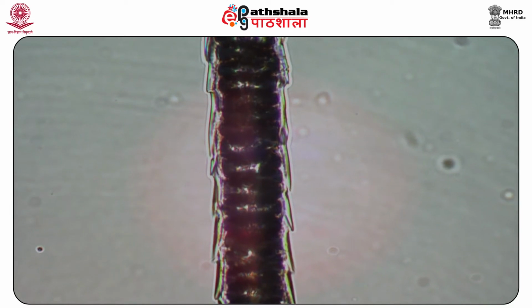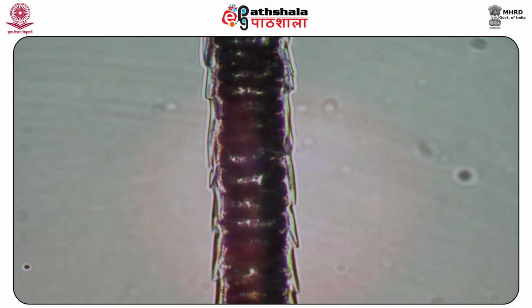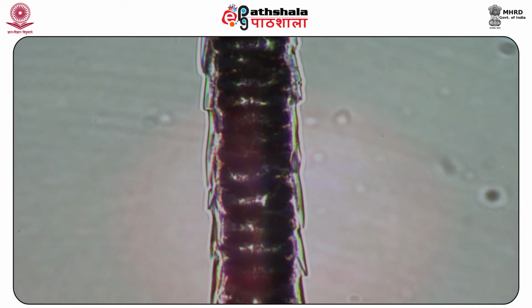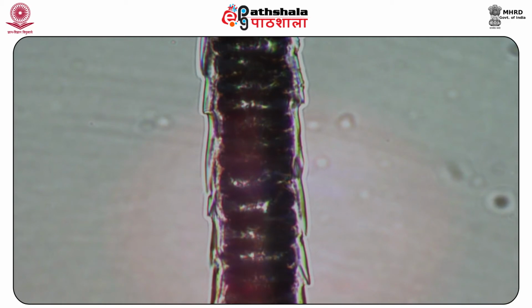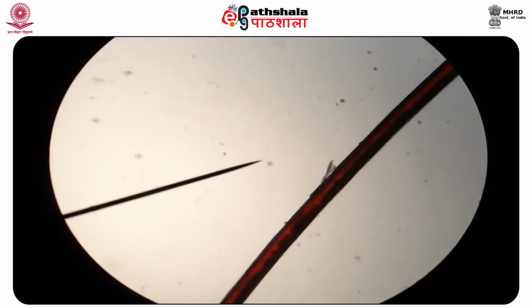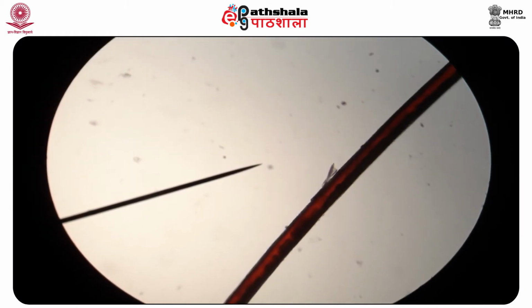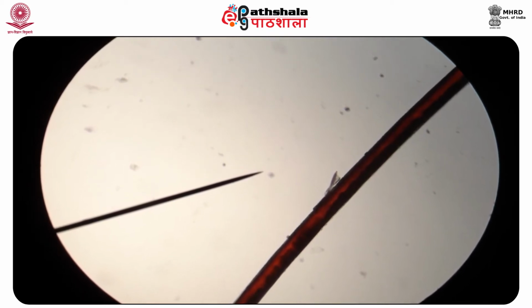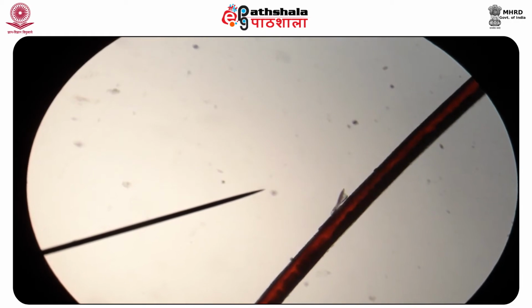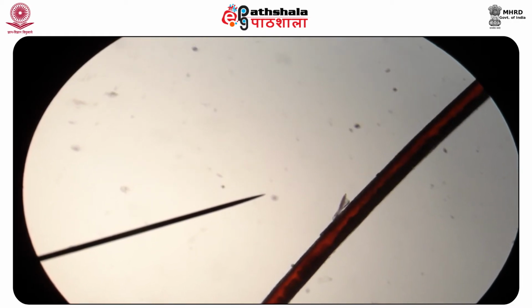Cleaned and washed hair should be dried before mounting it. Those hair samples which show thermal or mechanical damage may be more brittle and should be handled carefully. The various types of microscopes used for the examination of hair are as follows. First is the stereoscopic microscope. For initial examination of mounted or unmounted hairs, stereoscopic microscopes are used with a magnification range of up to 100x.